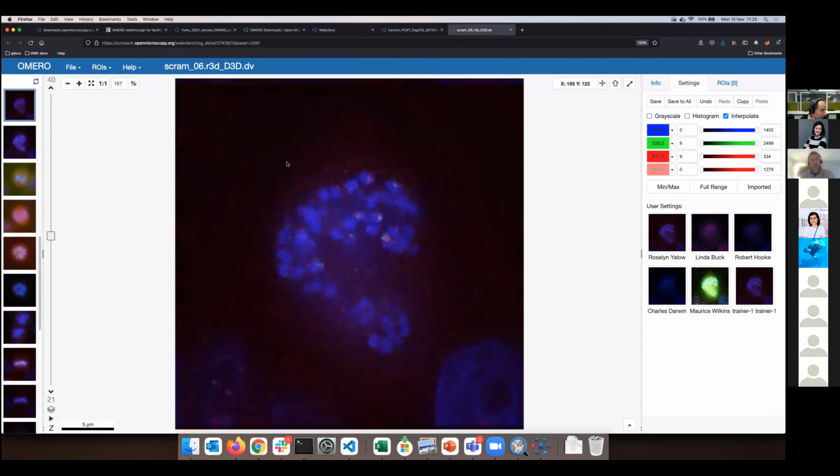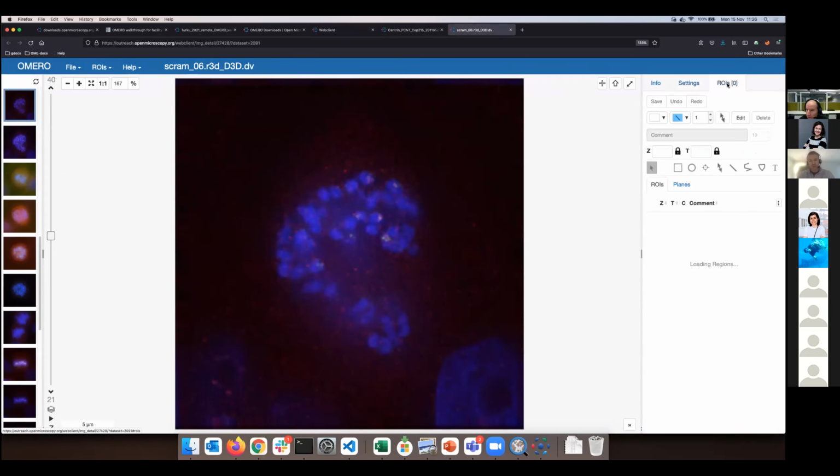So I'm going back to the Scrum image, which is 40 Z sections, and I'm exploring the regions of interest. For example, and this is against the remote, okay? The reason why it is kind of fast is that Omero iViewer is going clever about fetching the data and pushing them via internet to me.